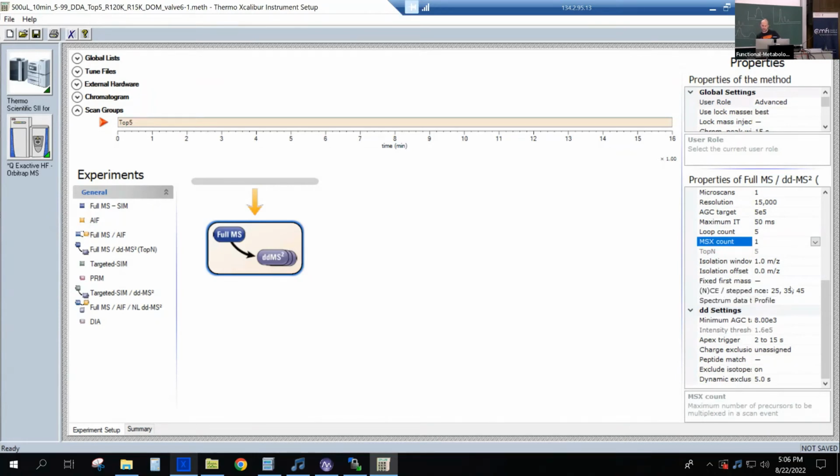Then, as I mentioned before, here collision energy. So we use NCE, that's normalized collision energy. And then I typically use this stepped collision energy here. And that's for basically most of our metabolomics runs. So unless I have a very particular compound I'm looking for, and I try to get a really nice looking fragmentation pattern for de novo structure elucidation, I just use that by default.